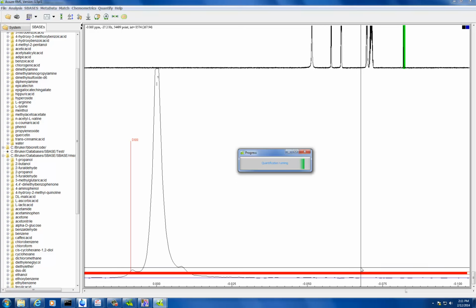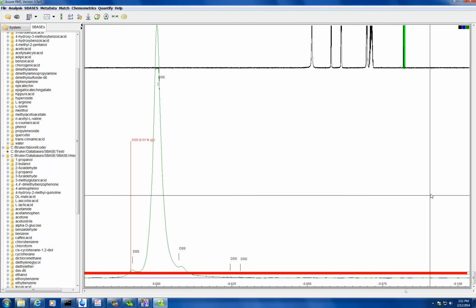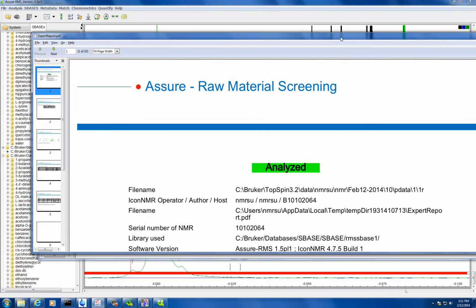Are you looking at our ursolic acid? Yeah. I showed the methyl groups spectrum of the combination of ursolic and oleanolic. Oh, right. Yeah, he was telling me that if I can make a mixture and come, then he can show. Oh, okay. Yeah.